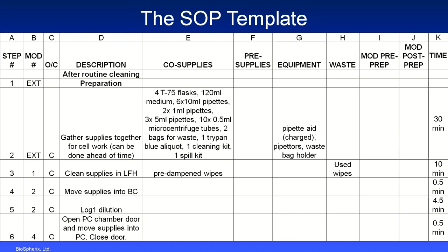Fill out this SOP template with just as much detail as you possibly can, right down to the right hand does this in this step and the left hand does this. This will make sure you don't miss anything that you're going to need inside the Xvivo system for your process.